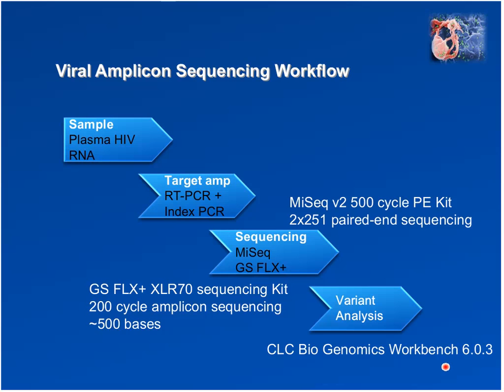I have an interesting one, and it's in your opinion. In your opinion, do you believe the MiSeq is ready for routine resistance testing? In my opinion, it is a very strong candidate for that application. As far as the workflow is concerned, there aren't any particularly complex steps or procedures that need to be taken to prepare specimens for sequencing on the MiSeq.